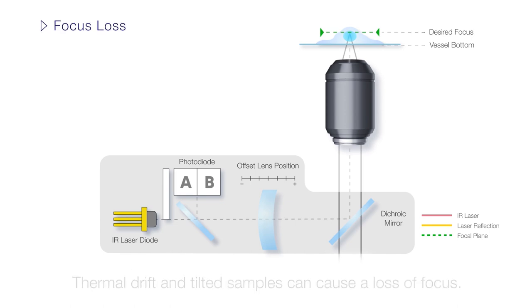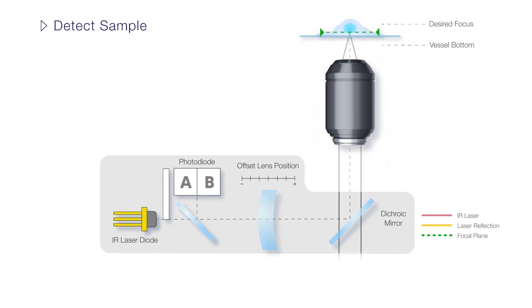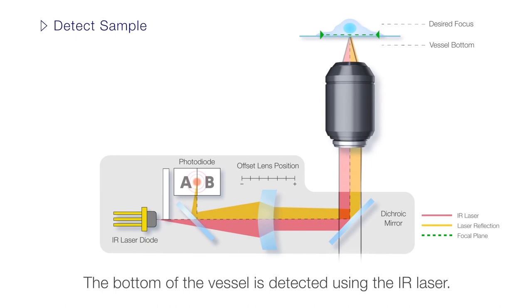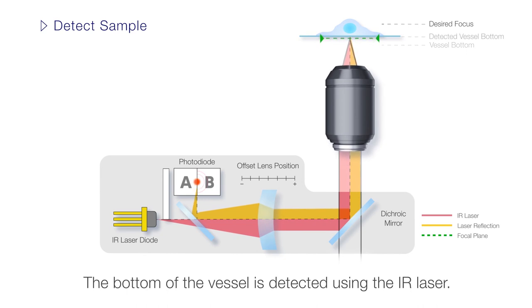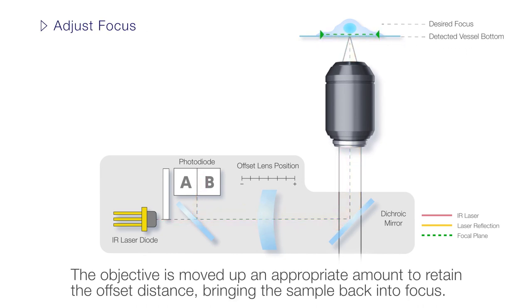During observation, a change in room temperature or movement of the sample may cause the focus to drift. The measured laser reflection enables the fully motorized TrueFocus Z-Drift compensator to automatically detect the sample's precise location and compensate for any movement or drift. Based on the offset determined during setup, the system readjusts the objective's position to bring the sample back into focus.